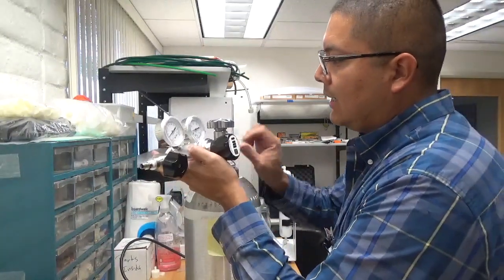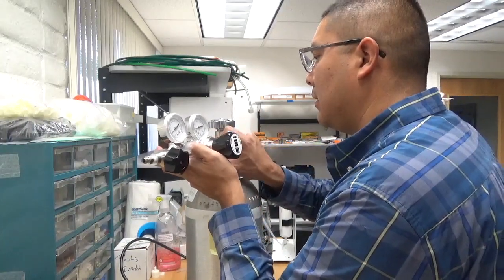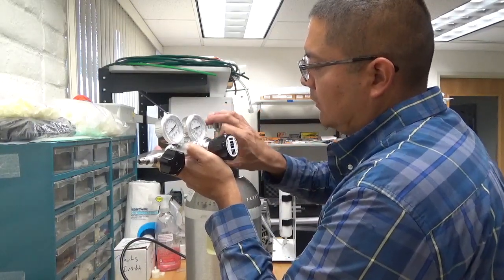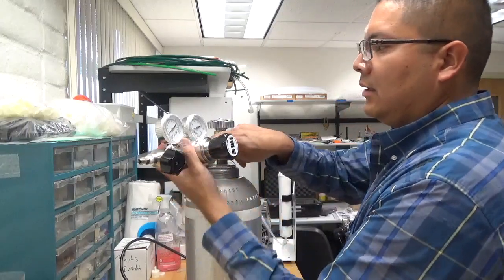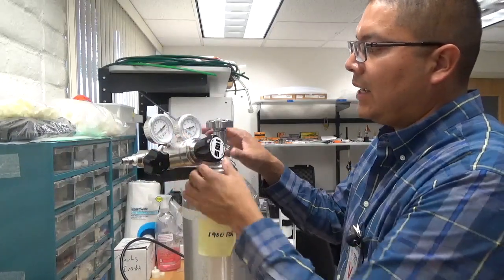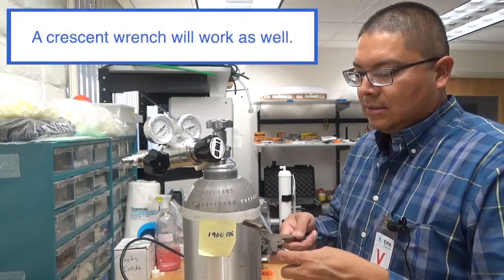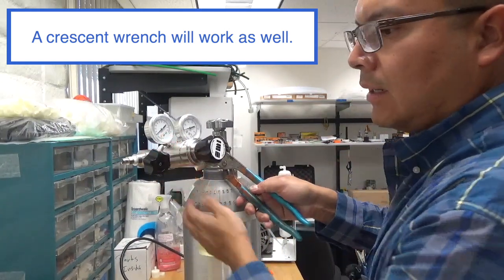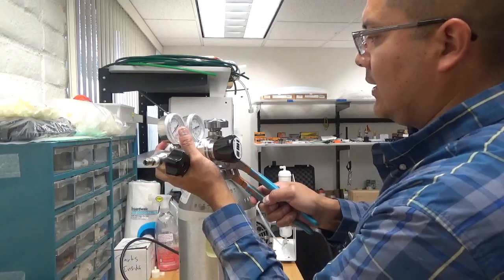So you want to begin by attaching your regulator valve. This turns clockwise onto your connection here at the cylinder valve. Your regulator valve will be able to slightly turn until you actually give it a good snug down. You'll need a channel lock or crescent wrench to do this. So it's pretty snug down on there.